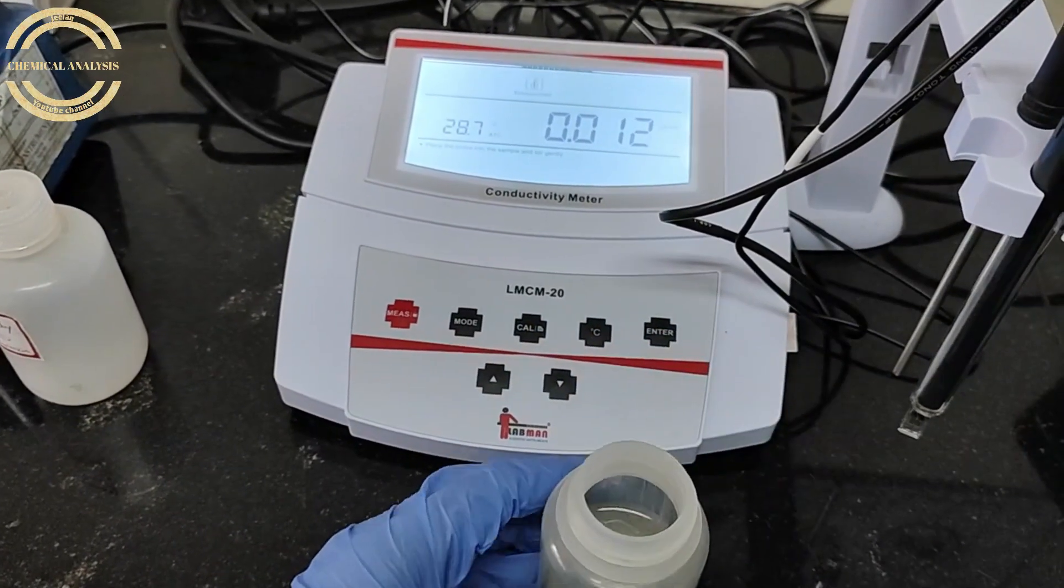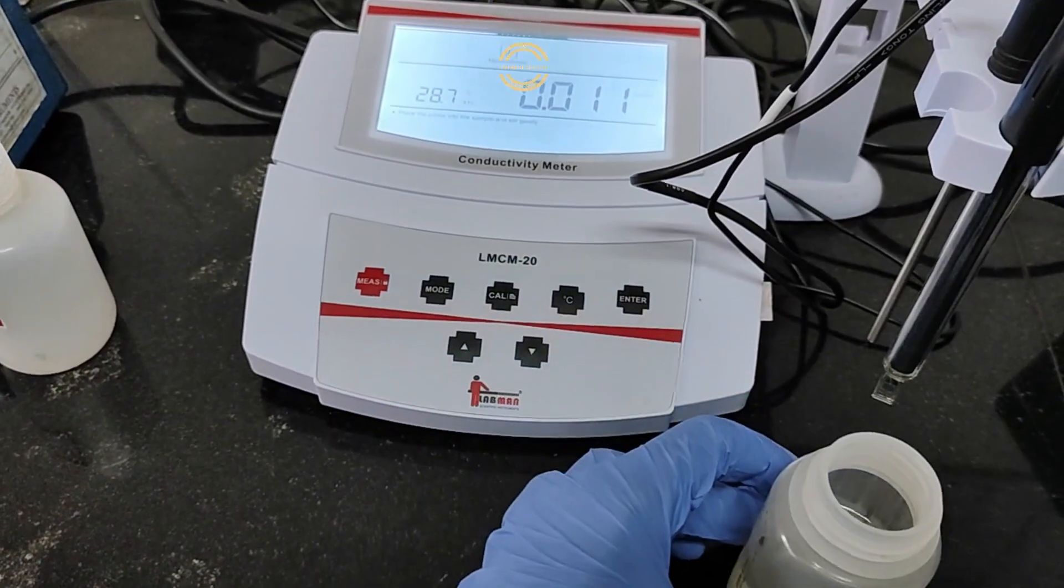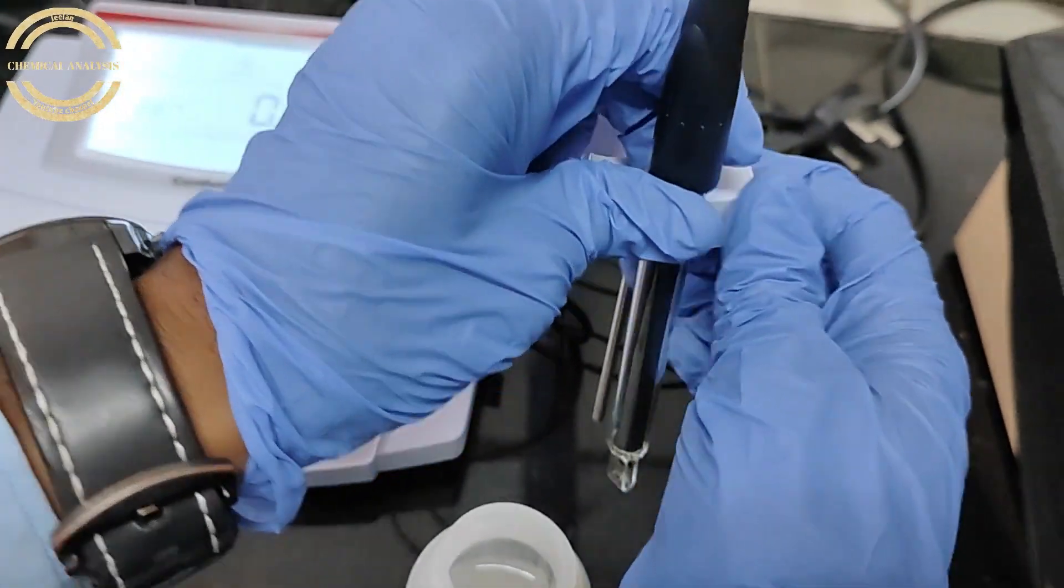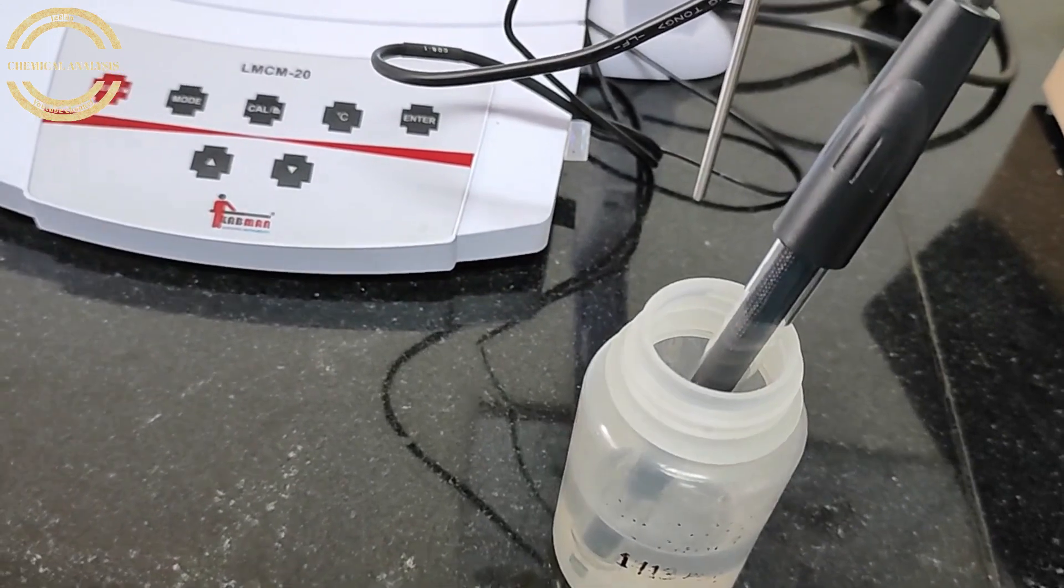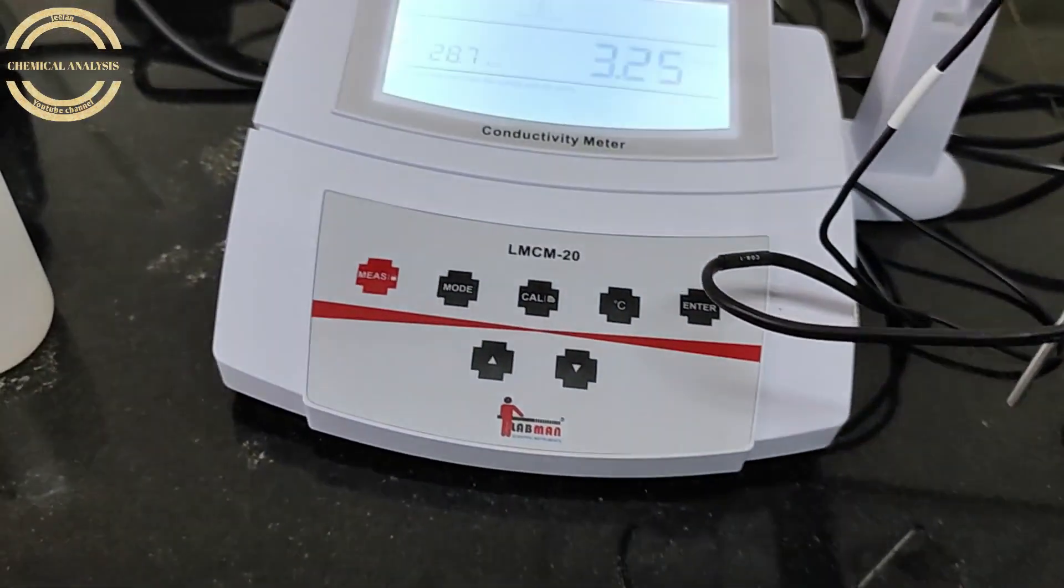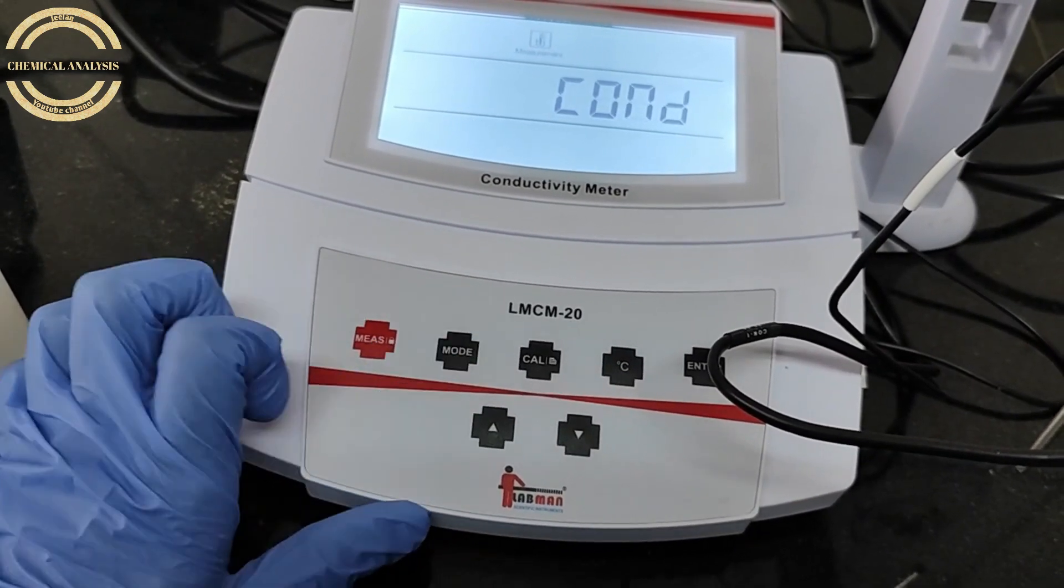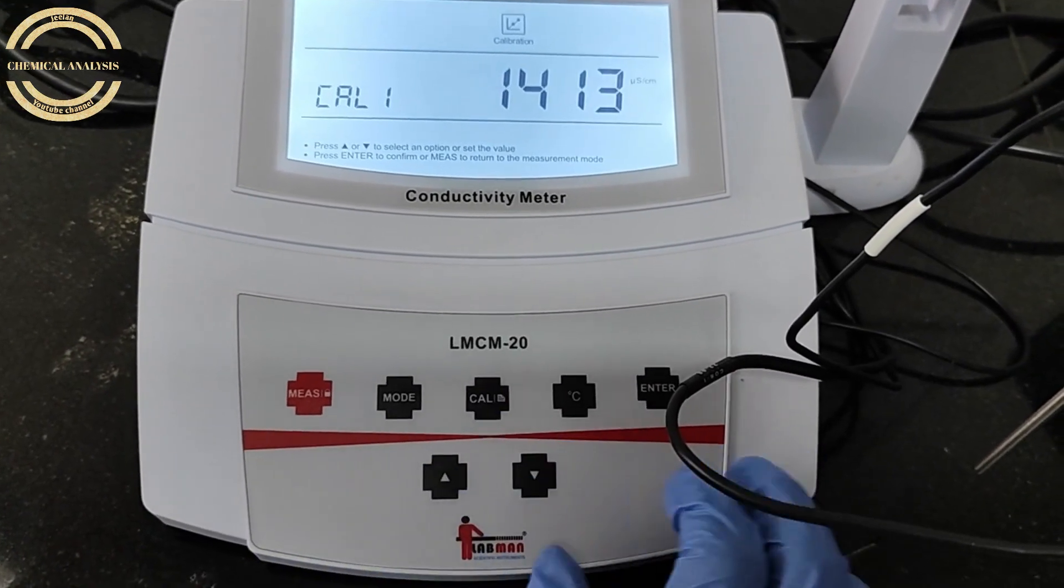Now take conductivity 1413 CRM solution. Put the electrode in the solution. In the instrument, press the mode button and select the conductivity option. Then press the calibration button and select the calibration option.